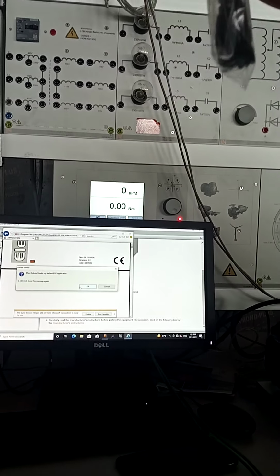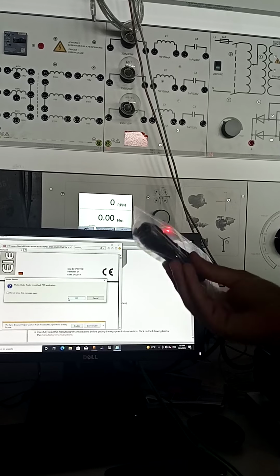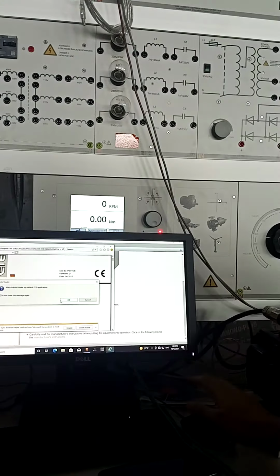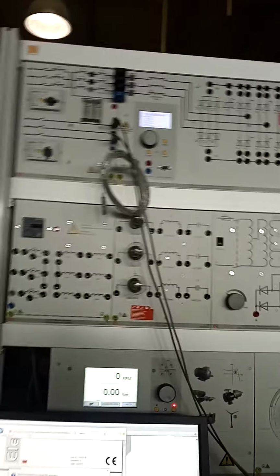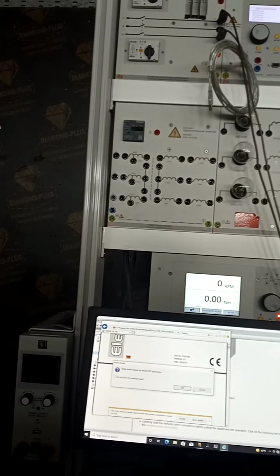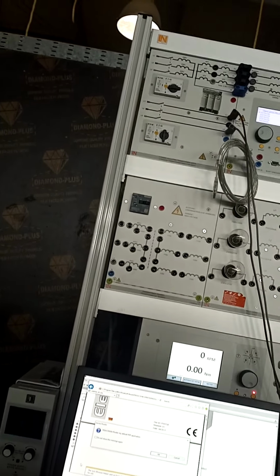Process margin, you have an option, but we don't use it here. You have USB here, so you can also configure with this USB. If you want to program settings and everything with a PC, here is one CD with software. It is not installed here, that's not our problem.